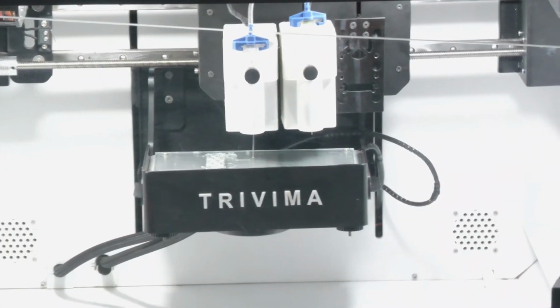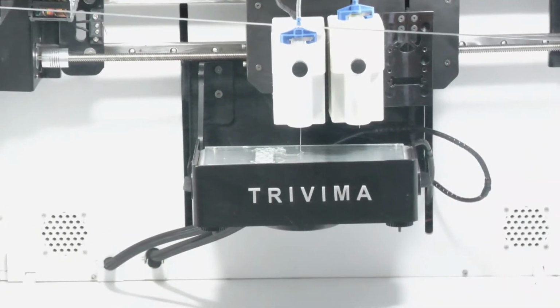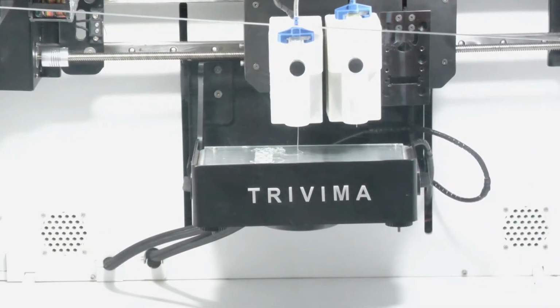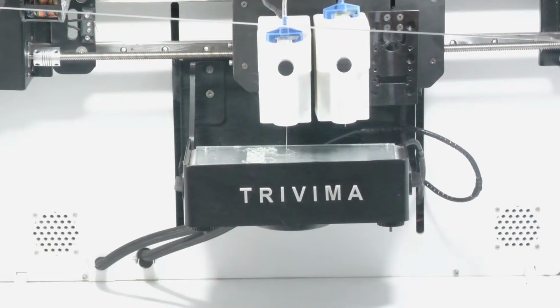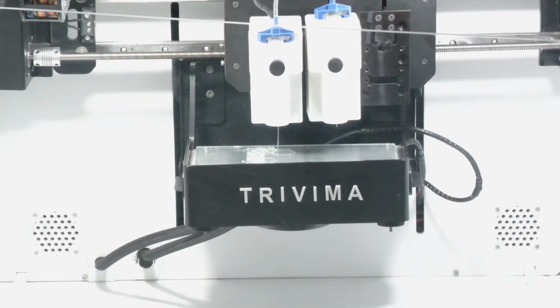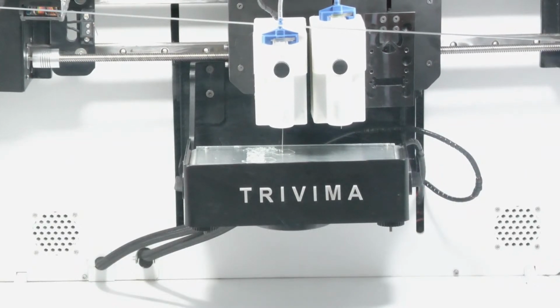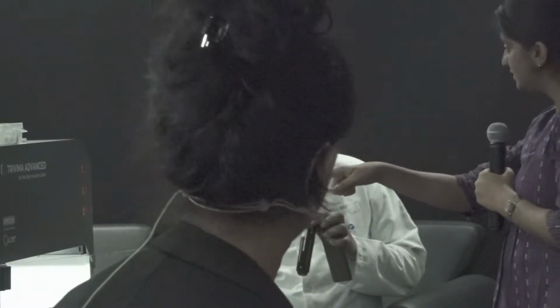You can control the volume, how much you are printing, and at what shape you would want the material to be printed. Suppose for the cornea, I need a conical shape, a spherical dome kind of shape, a little bit elliptical as well. So do you print a scaffold and then add the cells? In the material that you see, cells will already be fed in, along with the scaffold.